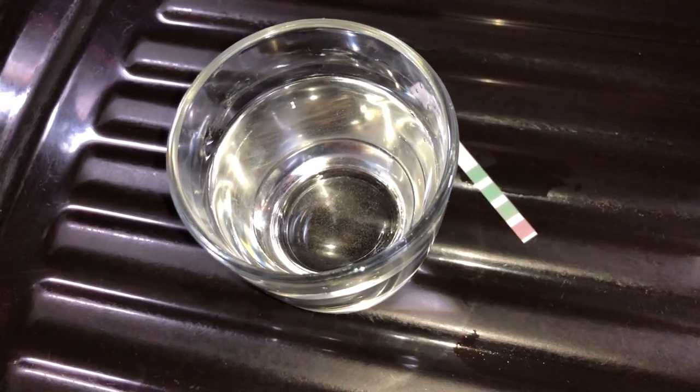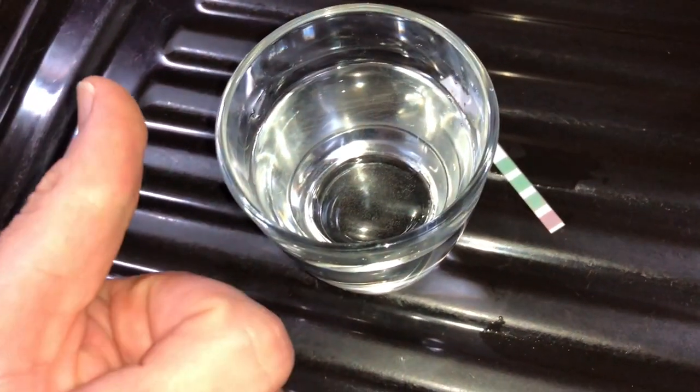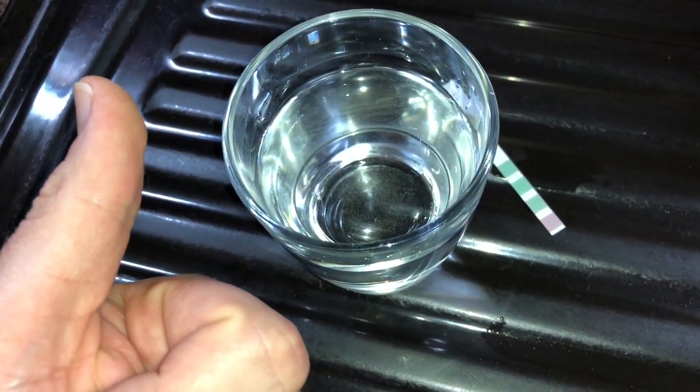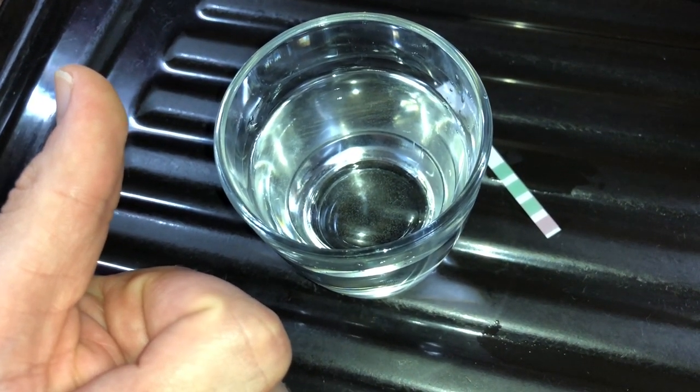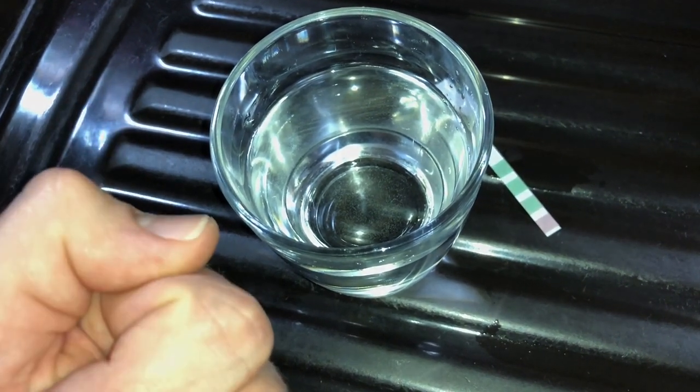Wherever water hardness is a concern, water softening is commonly used to reduce hard water's adverse effects.